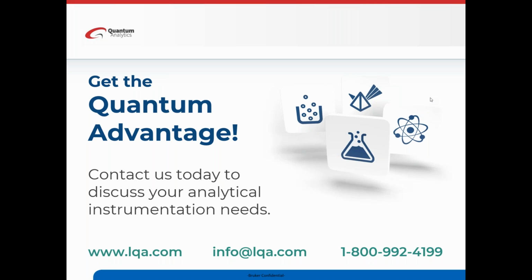Awesome. And then next question here is, are any of the systems that you've talked about sensitive to vibrations? So as it turns out, the smaller ones are not sensitive at all to the vibration. But the microscopes, it's actually the visible microscopy that's more sensitive than the infrared or Raman part. So if you look through the binoculars of a microscope, you can see the sample jitter as someone walks by if you're in a really noisy environment, but the spectroscopy won't matter.